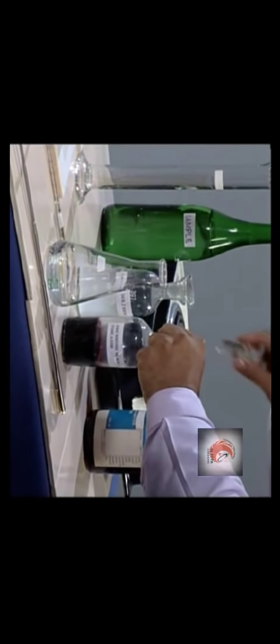And 5 to 6 drops of Eriochrome black T indicator. This is also called EBT indicator. Now the color changes to dark red. So we can start the titration.